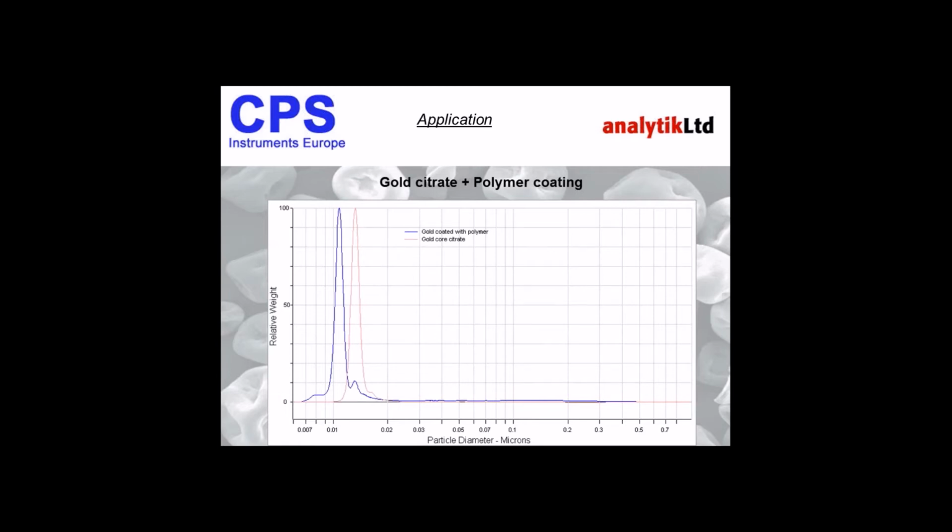Now, there is plenty of work happening with coating of nanoparticles. Typically, these can be heavy metal nanoparticles, metallic nanoparticles for drug delivery applications, and you could be coating a polymer, a sugar, a drug, many different examples. Imagine here, we've got a gold citrate particle. It's about 13 nanometers. You are coating this with a polymer. Now, the difference in size between the core and the coated is going to be marginal.